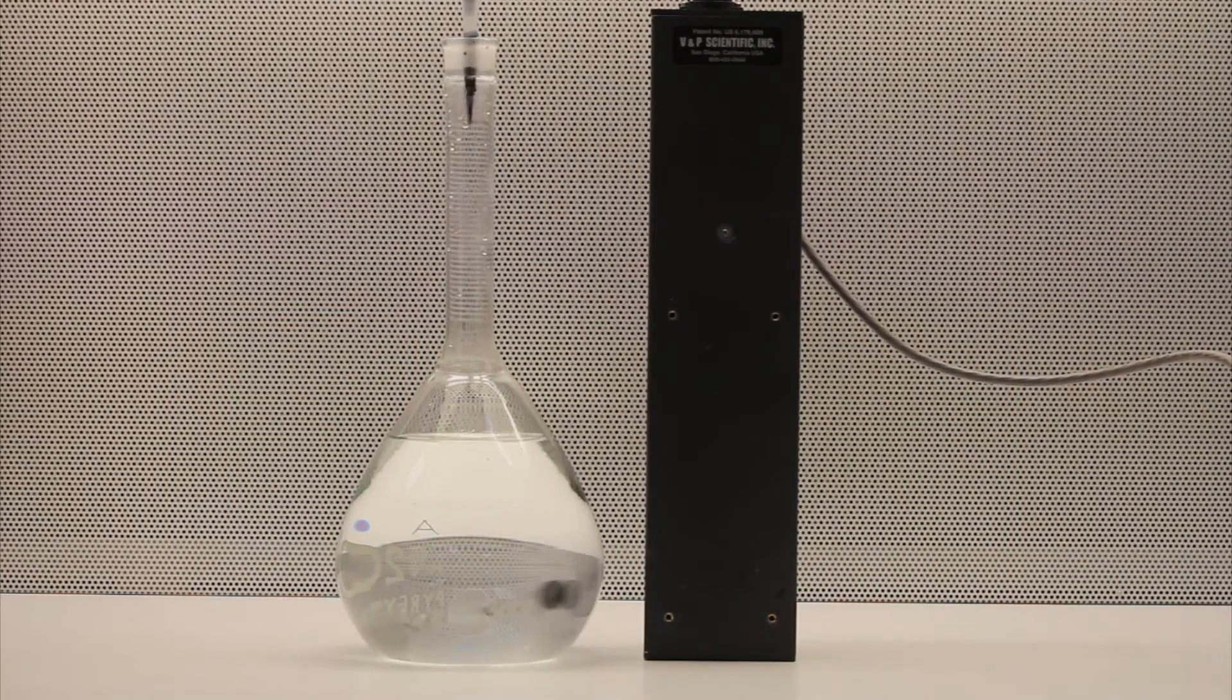As dye is added to this 2L volumetric flask, you can see the larger containers with different shapes can be used.